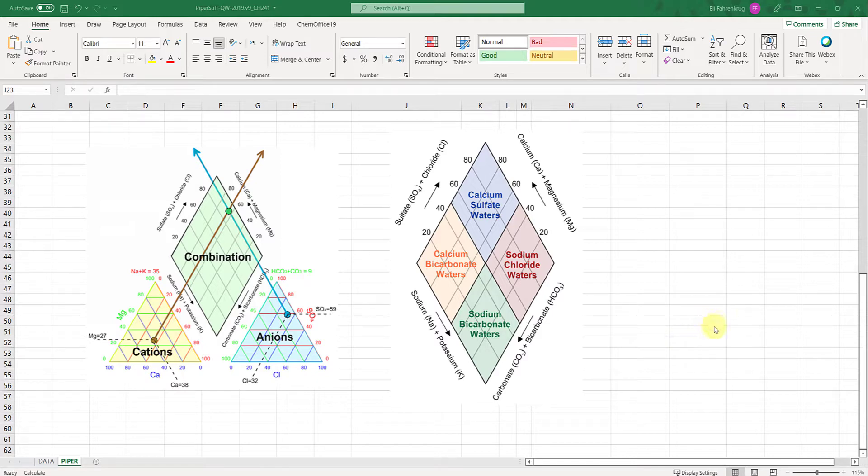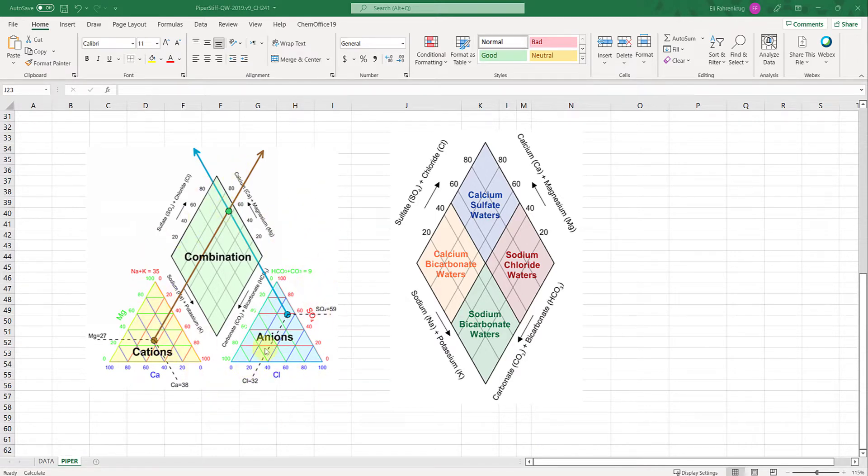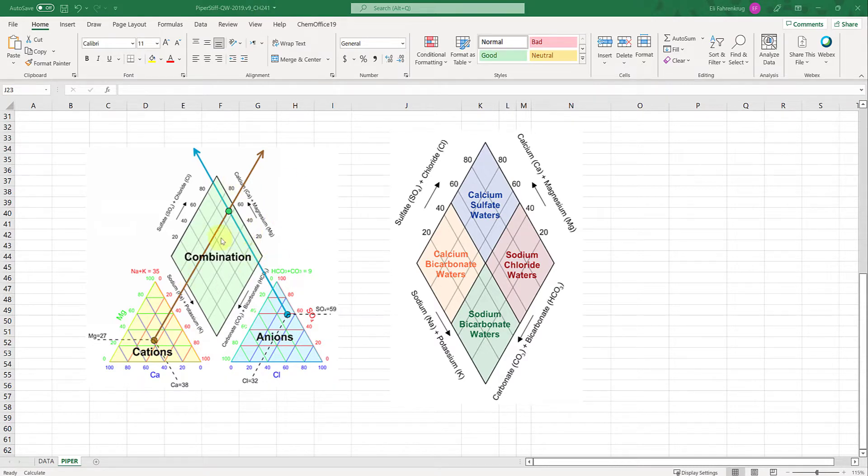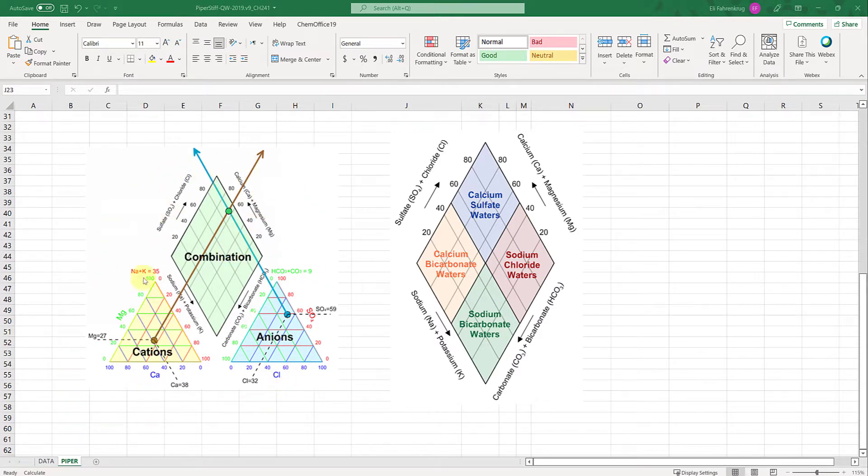An example of an actual Piper Trilinear diagram is shown here on the left. The spreadsheet that you'll have access to, Piper Stiff QW 2019 version 9 CHEM 241, will generate these for you as you input the data. Let's first talk about how to interpret this and what value it brings to our analysis.